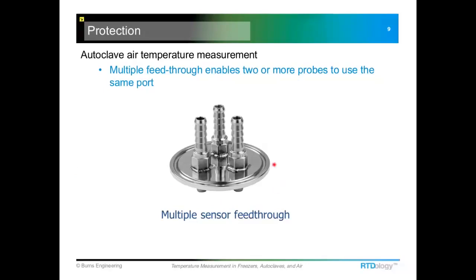Depending on the size of the tri-clamp, you could get several feed-throughs. And that hose covering on the probe just attaches to the little hose barb fittings here.